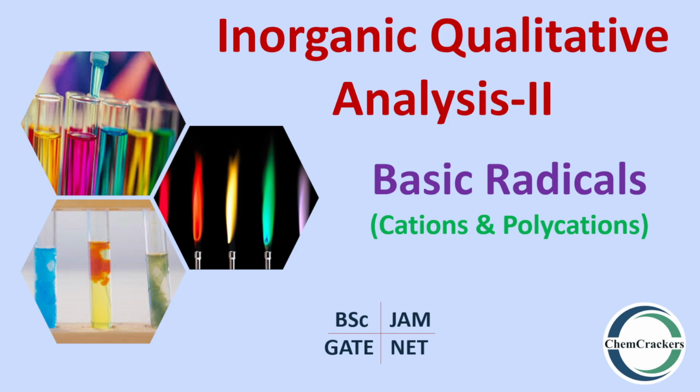Hello everyone. In this video, I will be discussing the qualitative analysis of basic radical, that is cation and polycation. To learn about the qualitative analysis of acid radical, make sure to watch the previous video in this series. Let us start with the identification of cation.